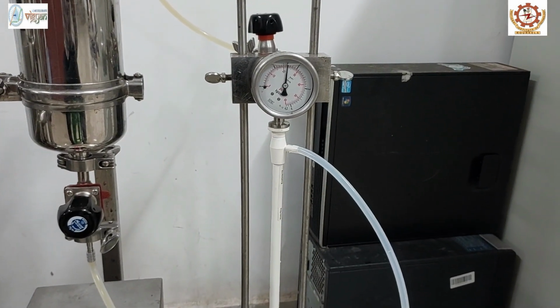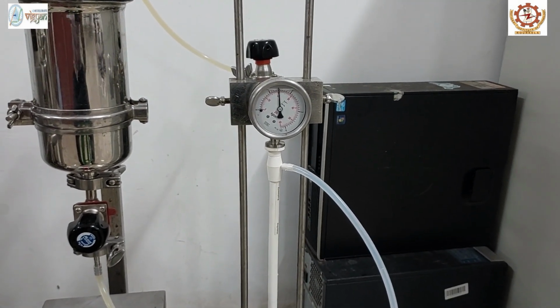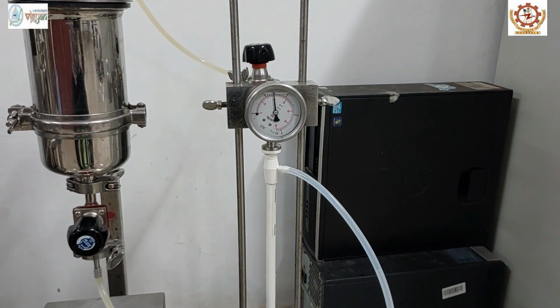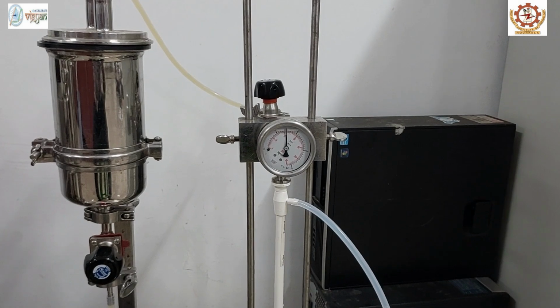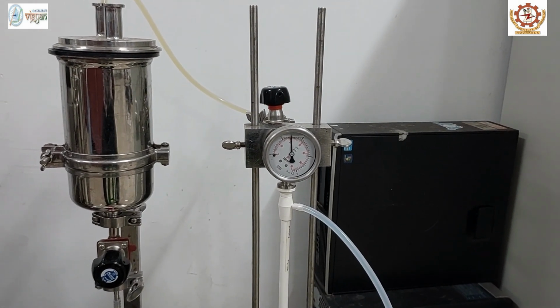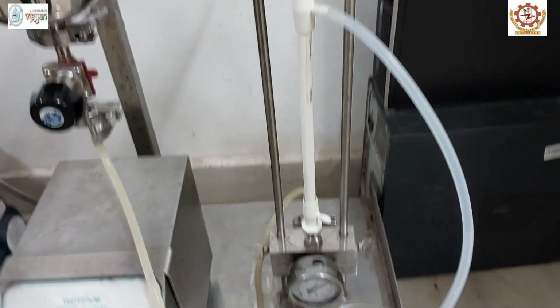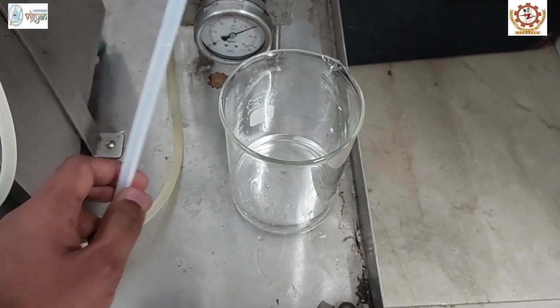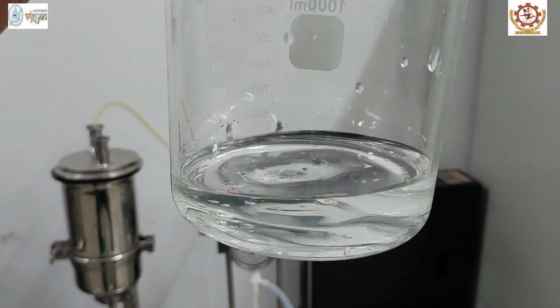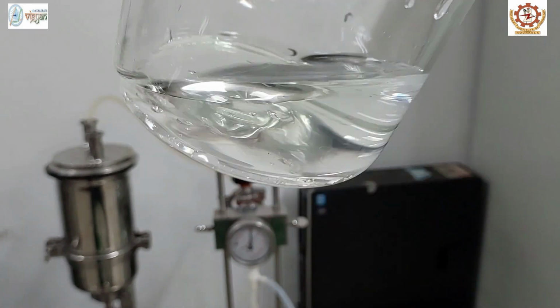Fouling can be reduced or controlled by various methods such as pre-treating the feed with enzymes, centrifugation, ultrasound, membrane heating, and membrane cleaning. Once the microfiltration is over, the clarified juice will be collected like this. You can see it is a very clear, colorless, turbidity-free juice.